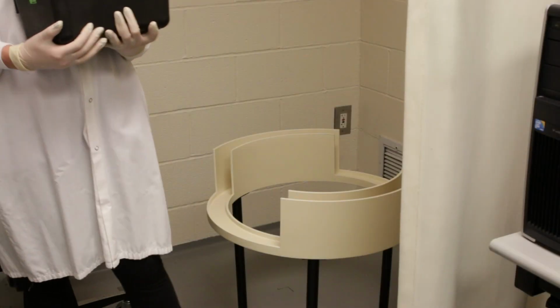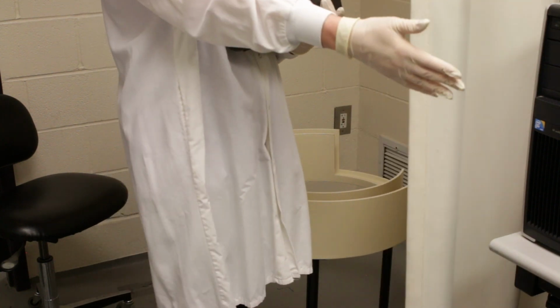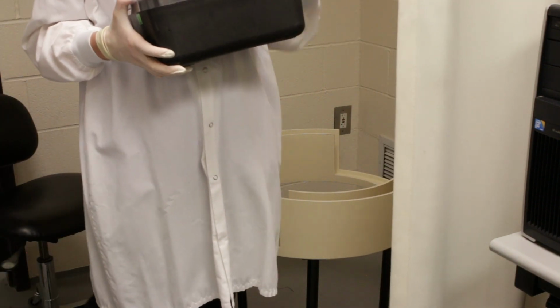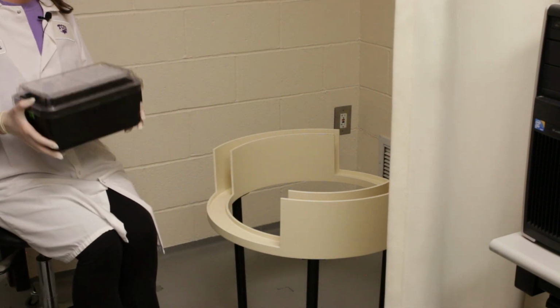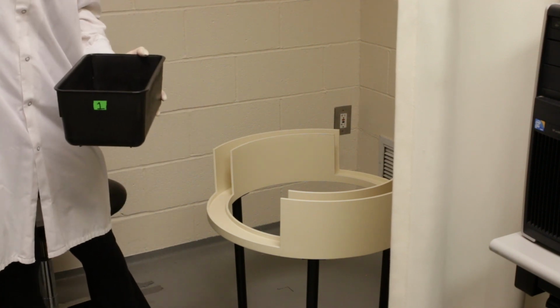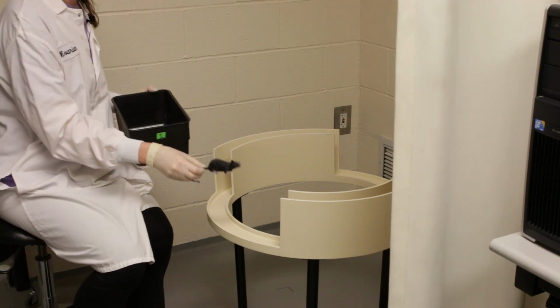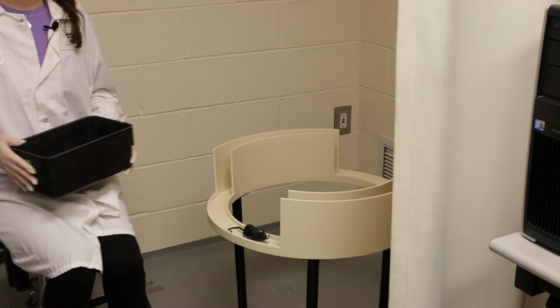Prior to running the test, we are going to be pulling this curtain back to ensure that the light from the computer does not come onto the Elevated Zero maze. So make sure that you do that before running the test. And when you bring the animal into the room with the transport box, you'll remove the lid and gently set it on a table and place the mouse into the Elevated Zero maze such that the mouse is facing one of the closed quadrants.